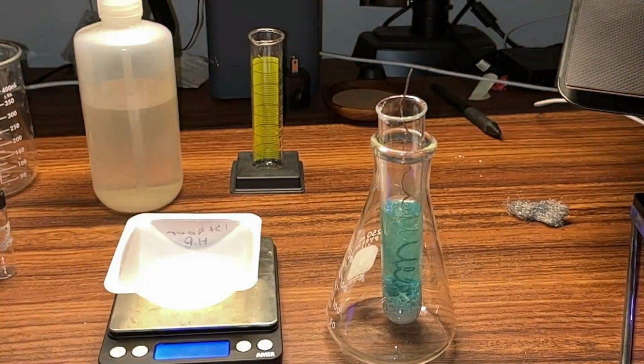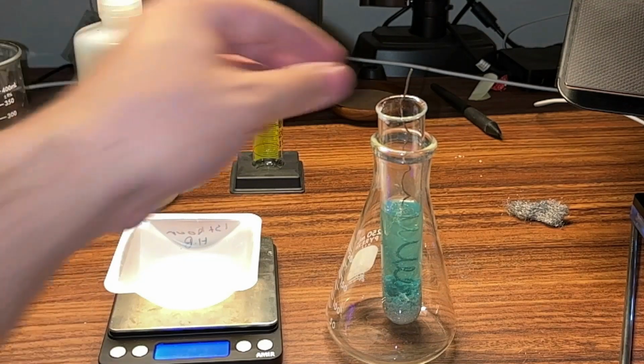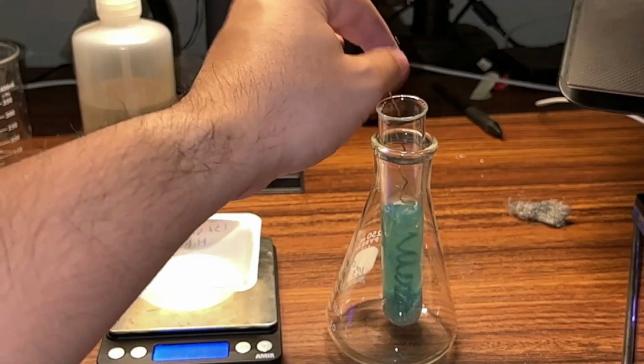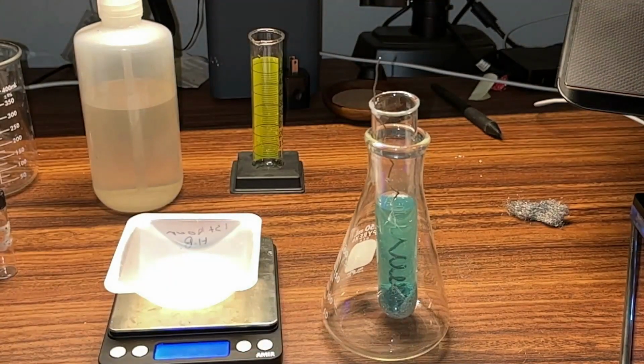Like I said, we'll let that go for a little bit longer. My goal is to get all of the silver out of solution and turned into crystals. So I think I'll just wait as long as that takes. Okay, I'll check in again later.